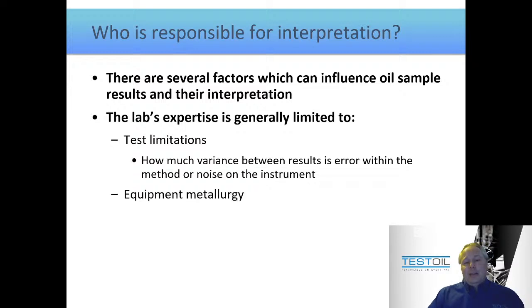They do have some idea as to equipment metallurgy, right? The basics of what comprises a shaft versus a bearing versus different types of bearings or different types of gears as examples. And this knowledge is kind of a shared knowledge. So they have some idea what sources could have indicated those wear patterns. They have ideas as to what type of contamination looks like via different analysis.